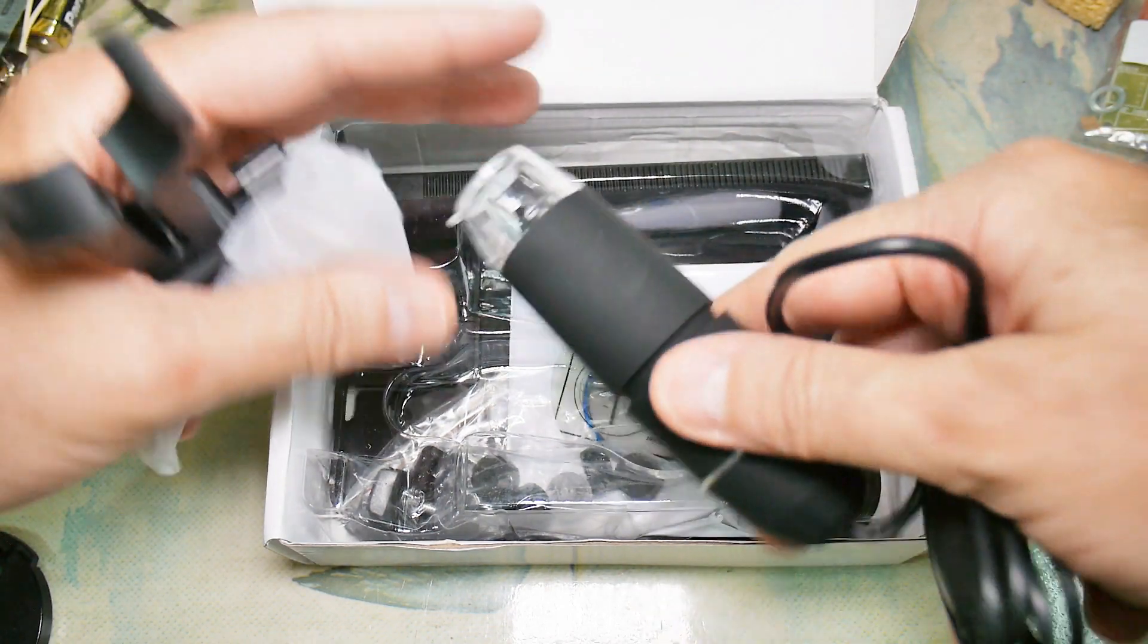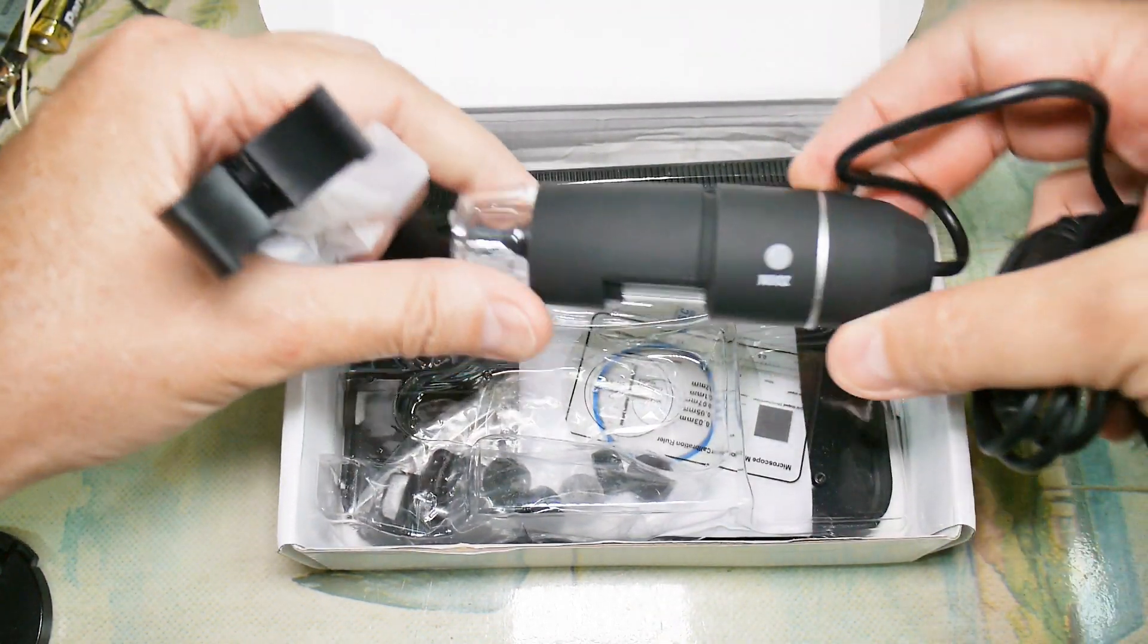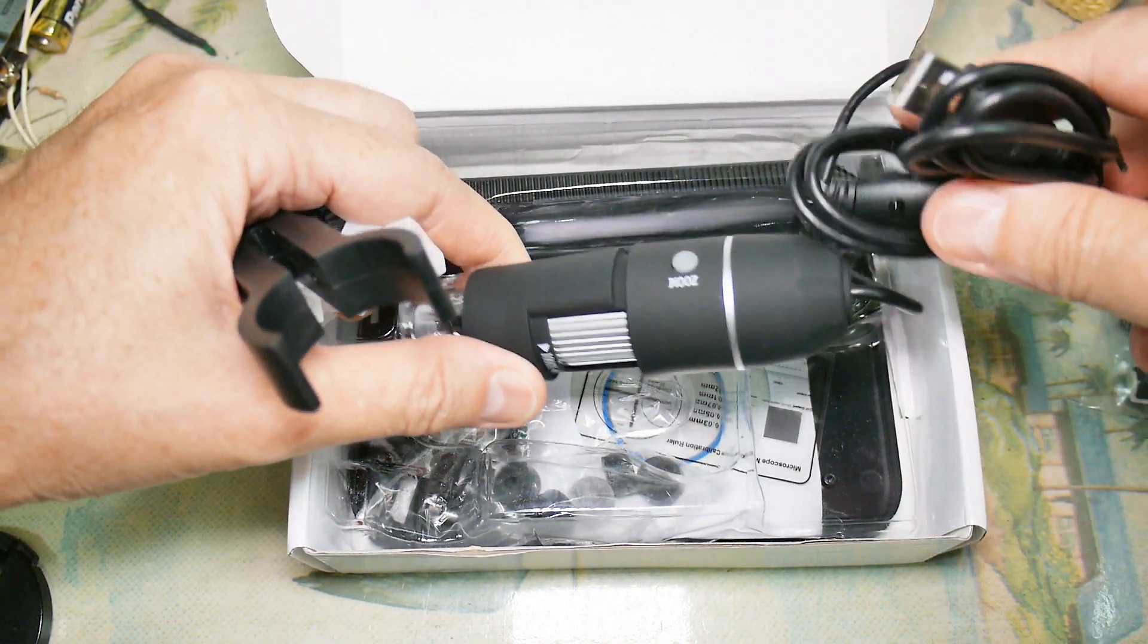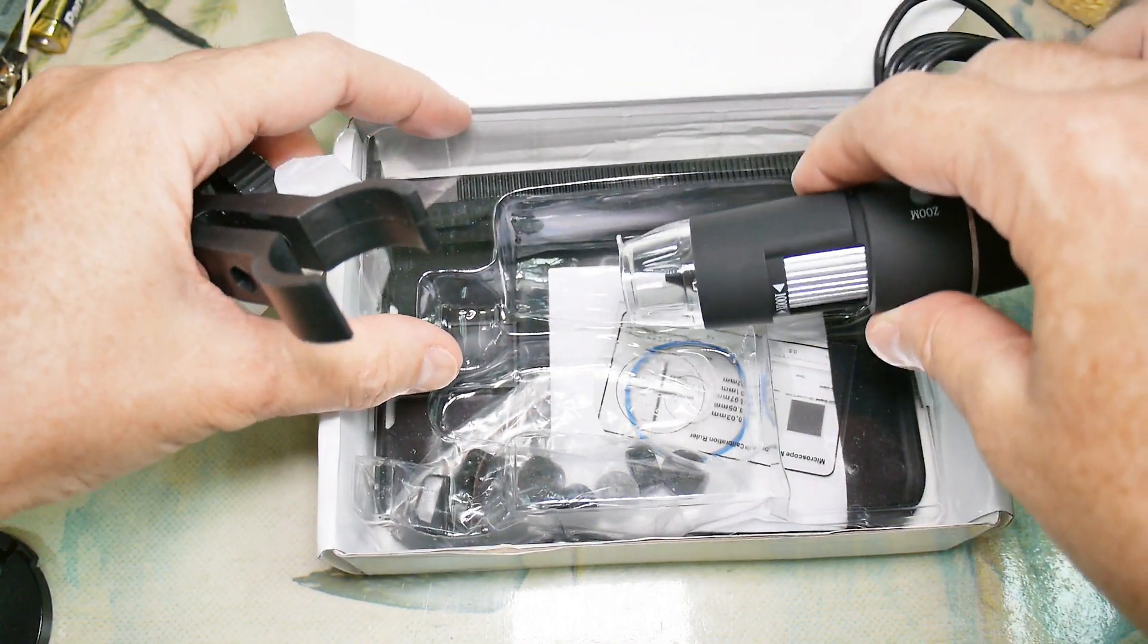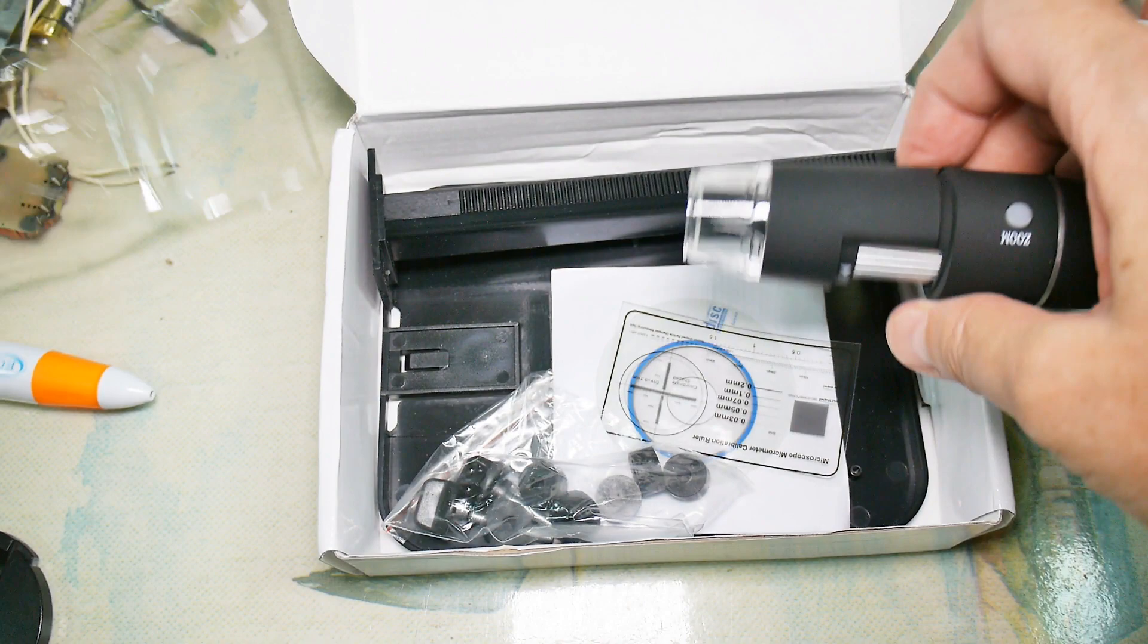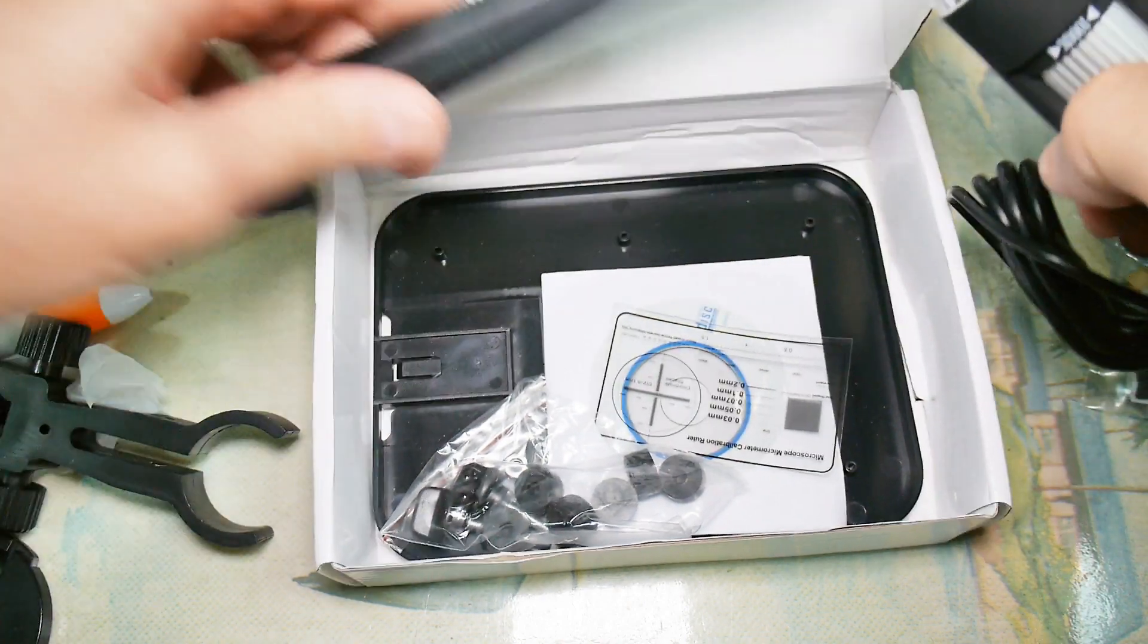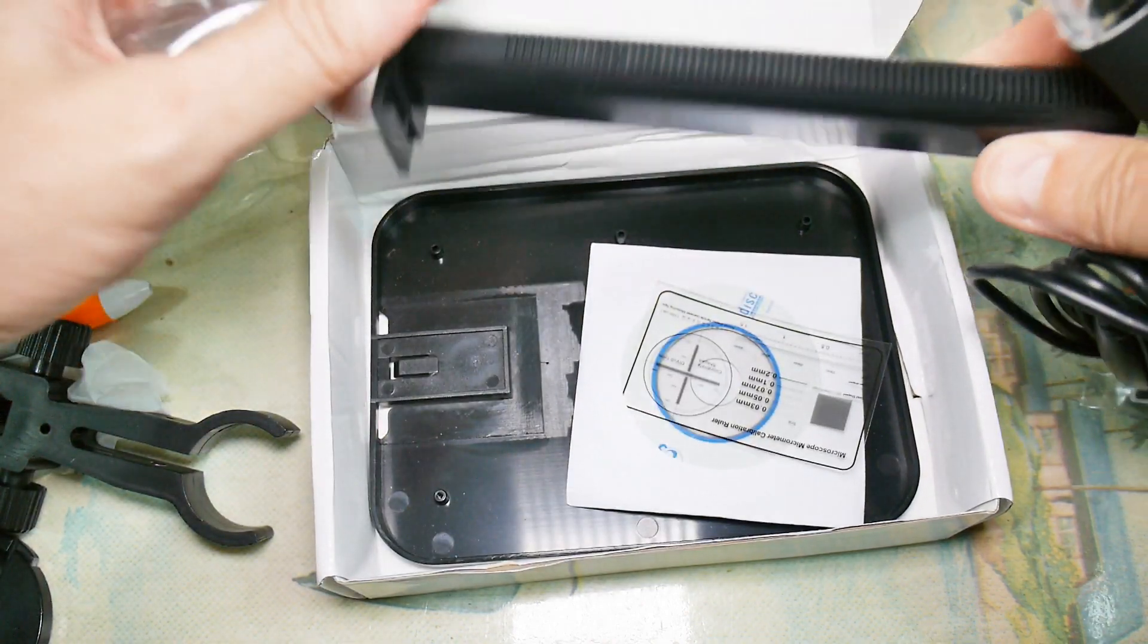There's not much to it. This one comes with a stand and this is the actual microscope right here. It's USB, plugs into a computer, so it'll depend on the computer and the quality of that screen, like my laptop.